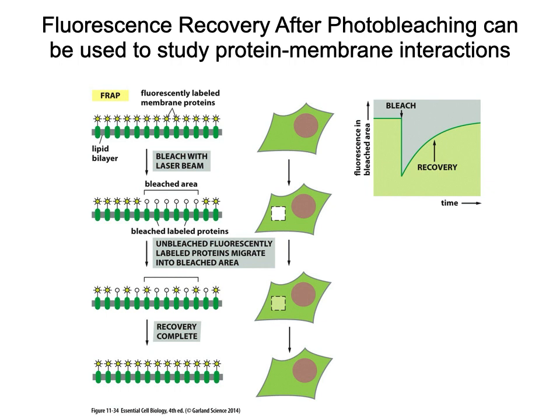And so what we're seeing here in this third cell down is, in that window, we start to have some recovery occurring. It's not the same intensity. Eventually you would get complete recovery because there would be the replacement of those damaged proteins with new proteins, right?